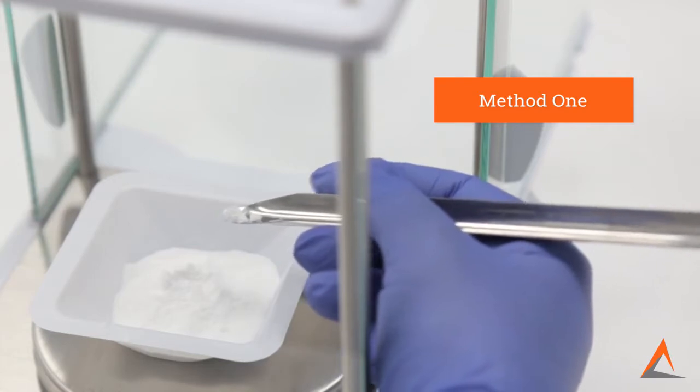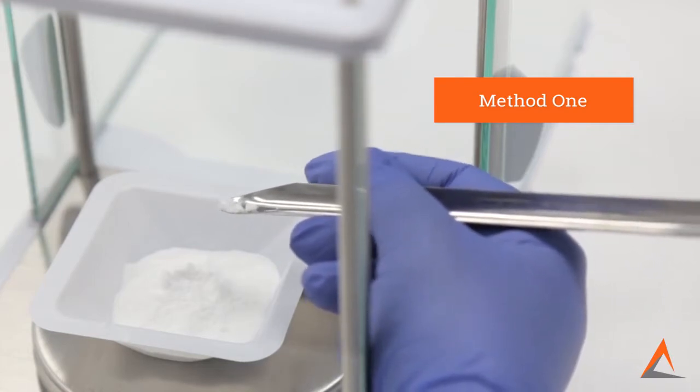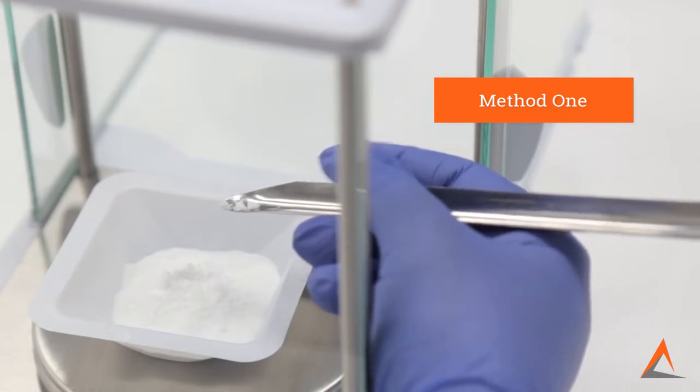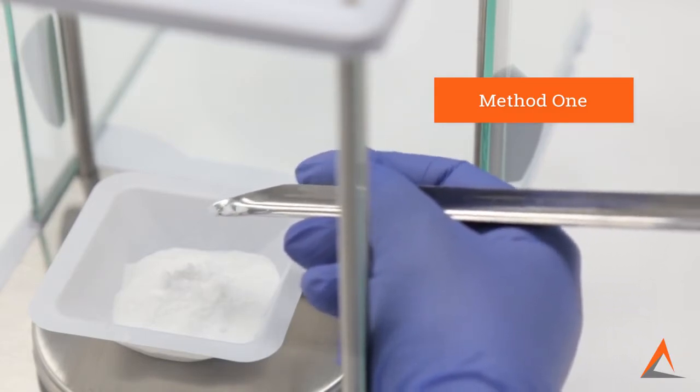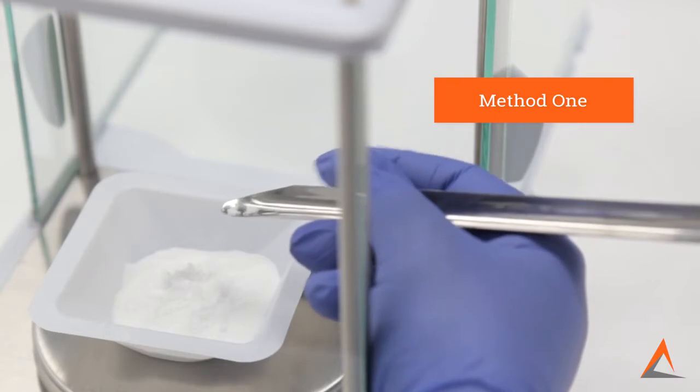Now when you lightly tap your index finger against the spatula, there's less movement and in turn more control of the spatula. This will allow a smaller amount of powder to fall into your weighing container.